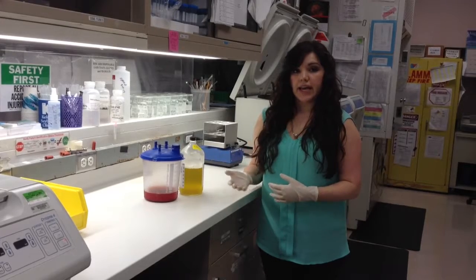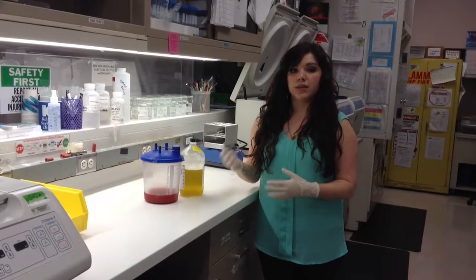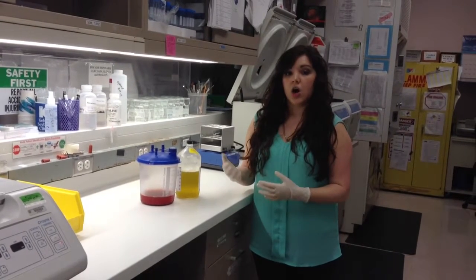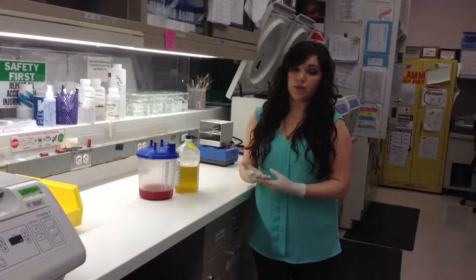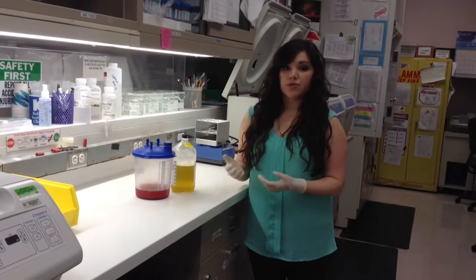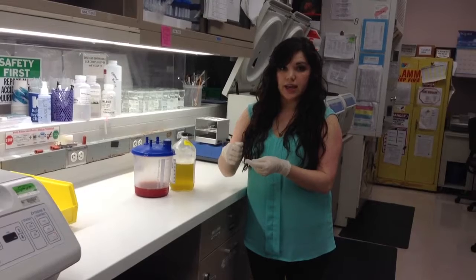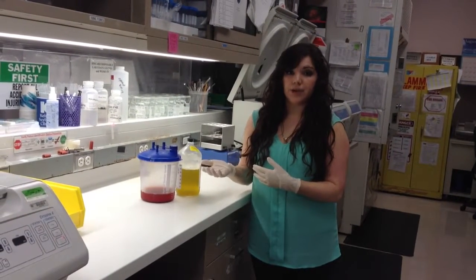At the end of the day, after they've practiced with the lotion, you can allow them to process a few more current cases and call some of those cases. Also, you can save some of the sediment from the morning time when you were practicing with finalized cases and smear those out. This will give them the opportunity to experiment with how much pressure they apply to the slide and what kind of effect that has microscopically.